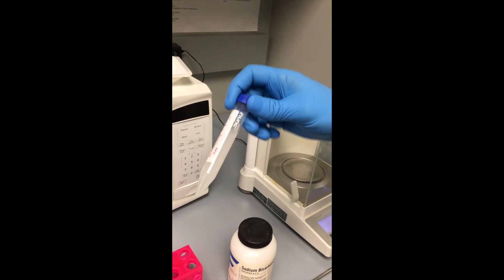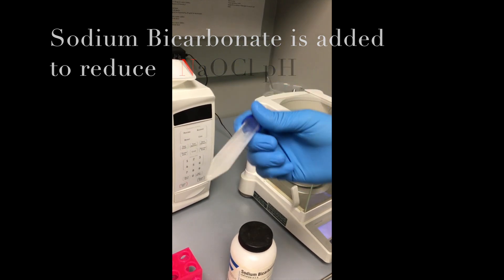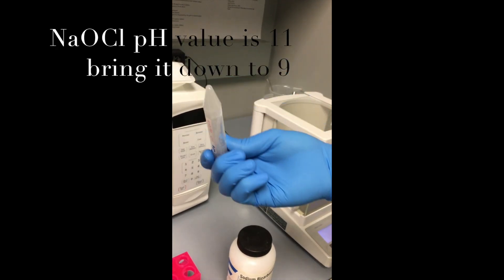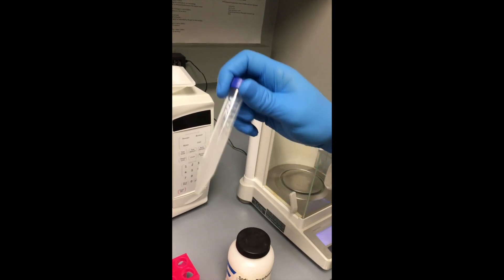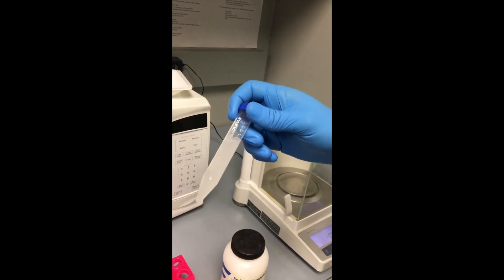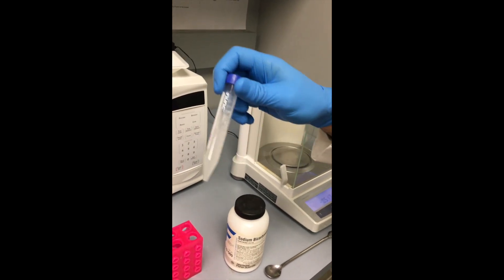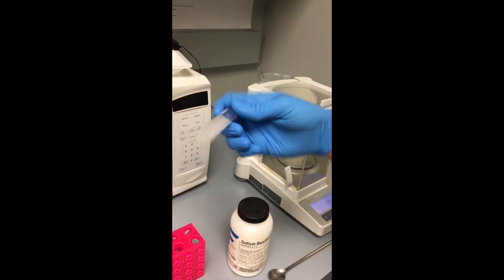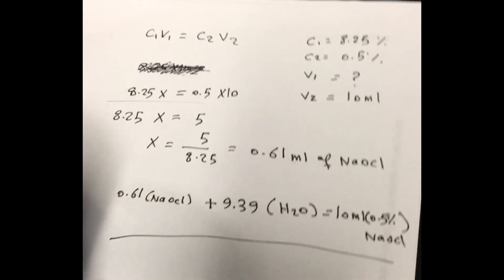To adjust the pH of sodium hypochlorite, this solution can serve as a buffer to reduce the pH. The regular pH of sodium hypochlorite is around 11, and we need to bring it down to pH 9. We use this solution because it has no side effects and no damage to living tissue, unlike hypochlorite which can have some effect on living tissue. So we're going to use sodium bicarbonate to adjust the pH.